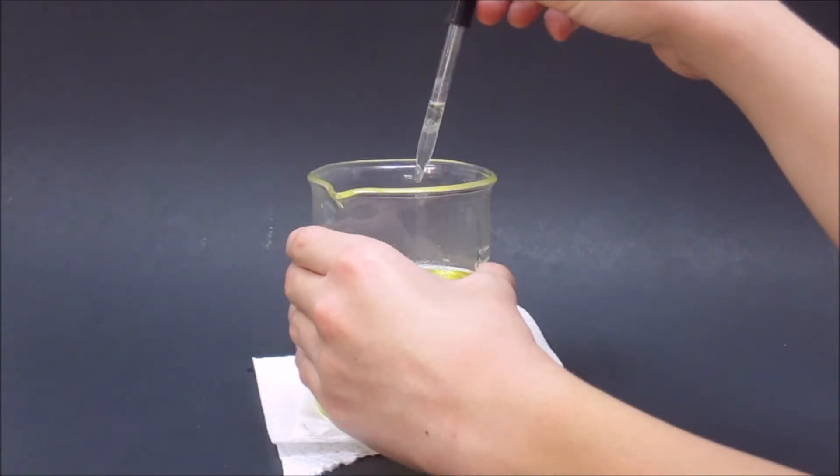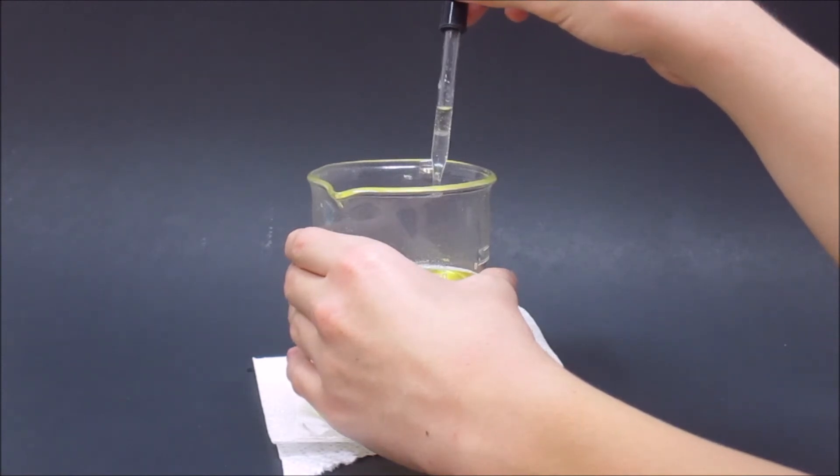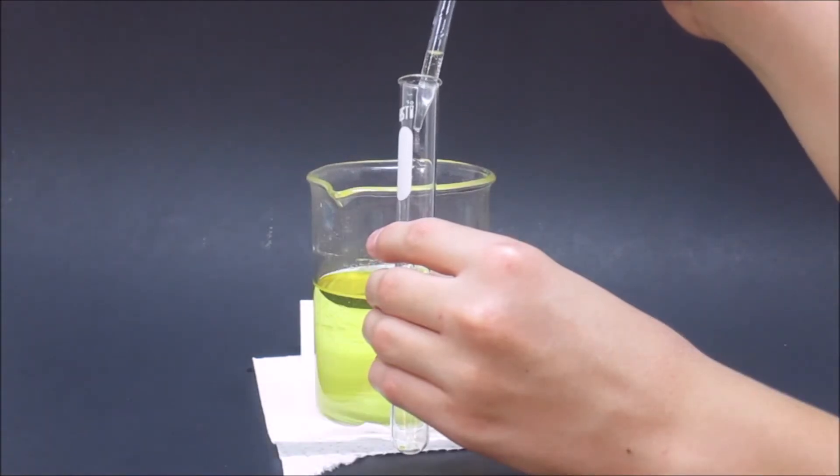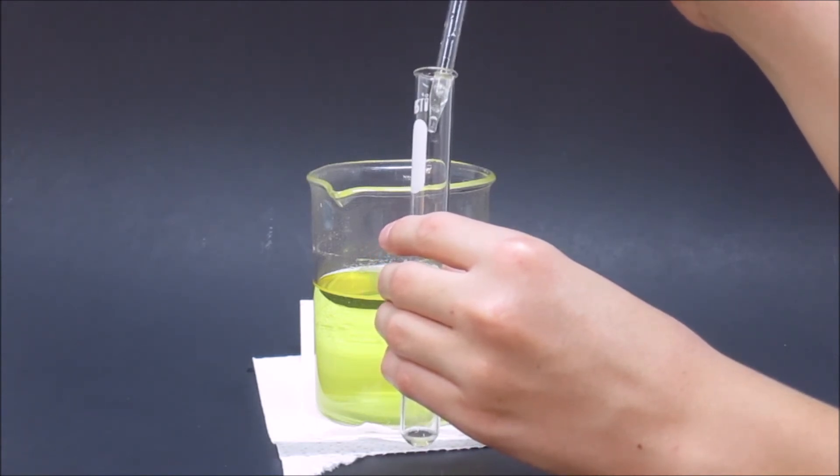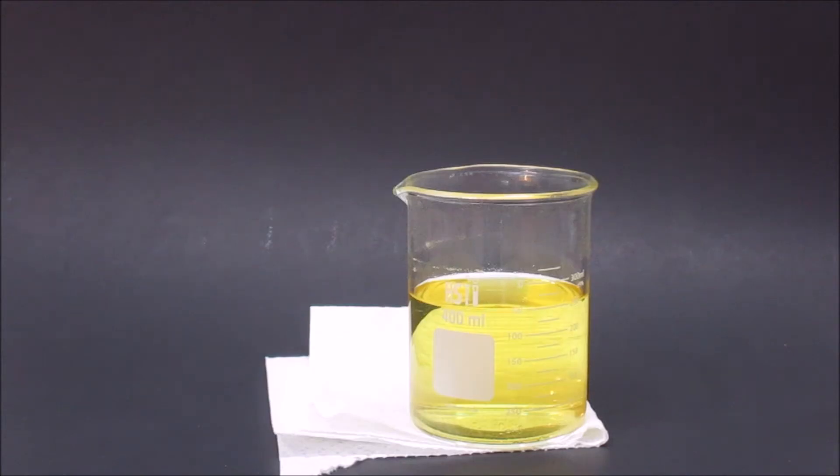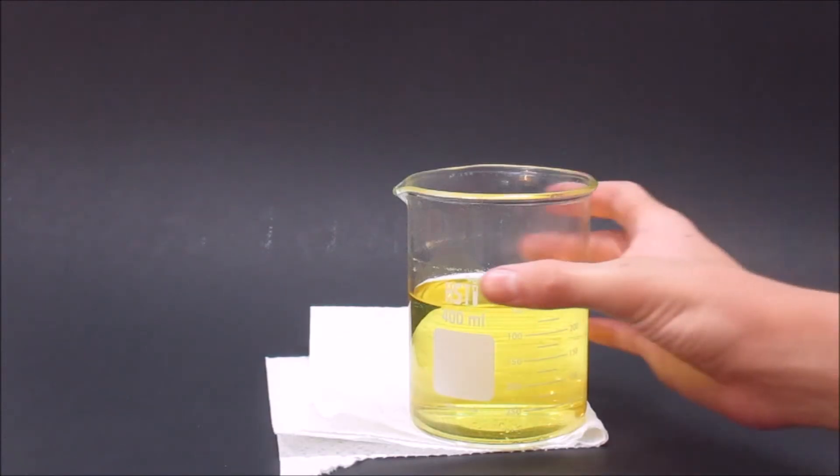Then I removed the chloroform from the beaker. I did this by extracting with a pipette and then putting it into a test tube. Then I put the rest of the mixture to the side.